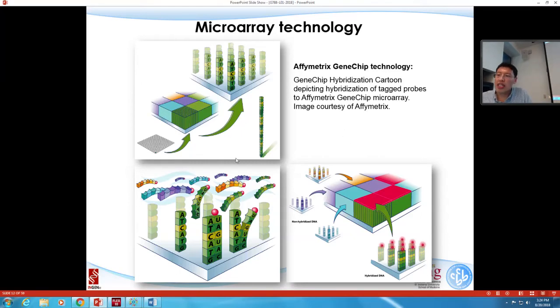Okay, so this is the microarray technology, which is, I would say, super smart. It was invented somewhere in 1998 and started to become commercialized by the year 2000. And there are a couple of microarray manufacturers. I believe Affymetrix is one of the major manufacturers. And the size of this chip is just the size of your thumb, and sometimes they can put in many, many different smaller compartments in those regions.